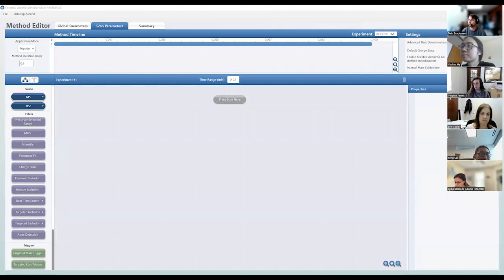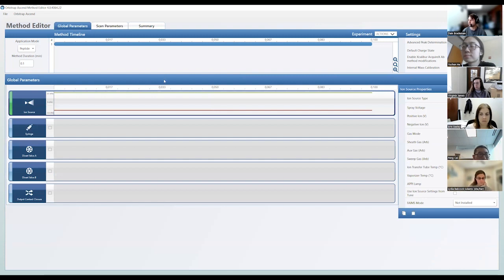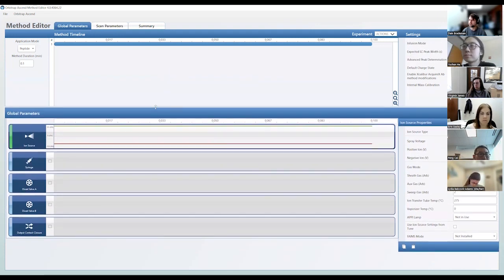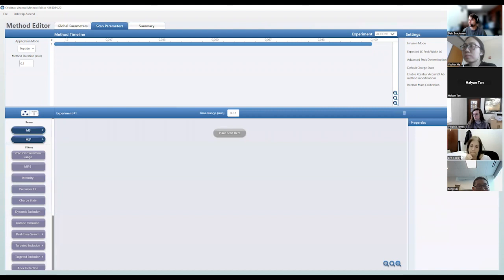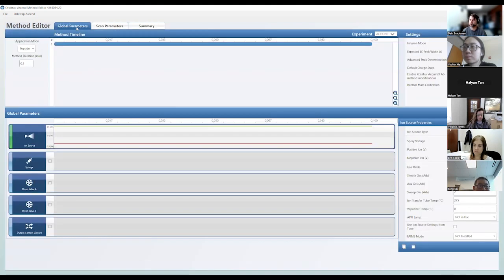There are a couple of different things you need to consider when setting up a method from scratch. There are three main tabs in the method editor: global parameters, which are set across your entire experiment; scan parameters, which are specific for a subset of your experiment corresponding to this blue bar — you can have multiple bars; and a summary tab. Note there's no LC attached here — that's controlled with different software, so I'll ignore the chromatography and focus on the mass spec.